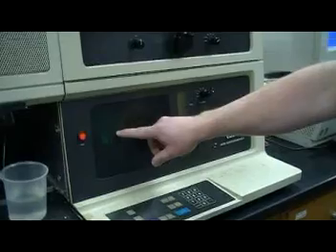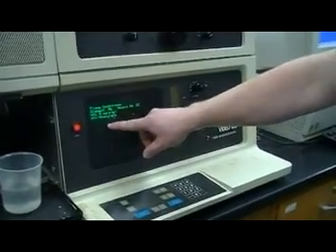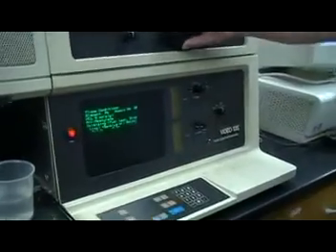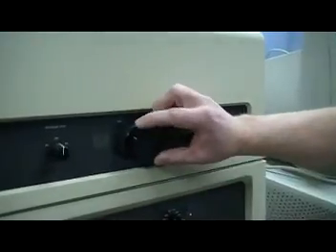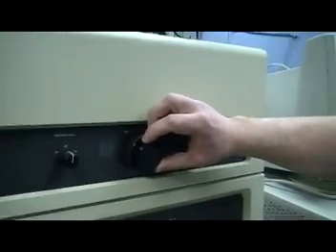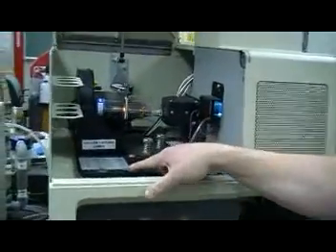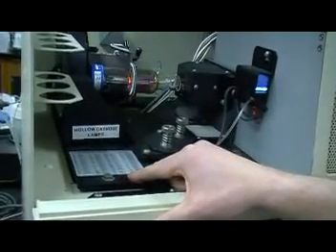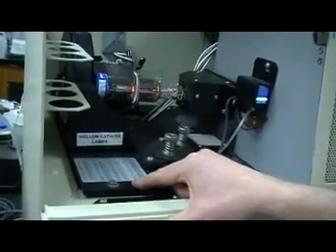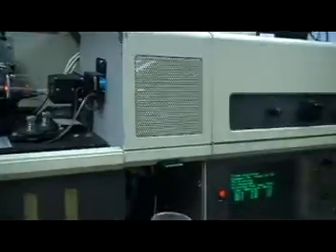And then it gives you a list of 3 different wavelengths that you can use to set it. And so typically we'll be using 217, and so this is the wavelength knob. And if you look closely, you can see that it says 217 on here. You can adjust the wavelength knob by turning this right here. Another place where it says the wavelength is if you open this up, there's a card here, and for lead, where's Pb? There, 217. So you have 2 different sources that tell you what the wavelength is supposed to be.